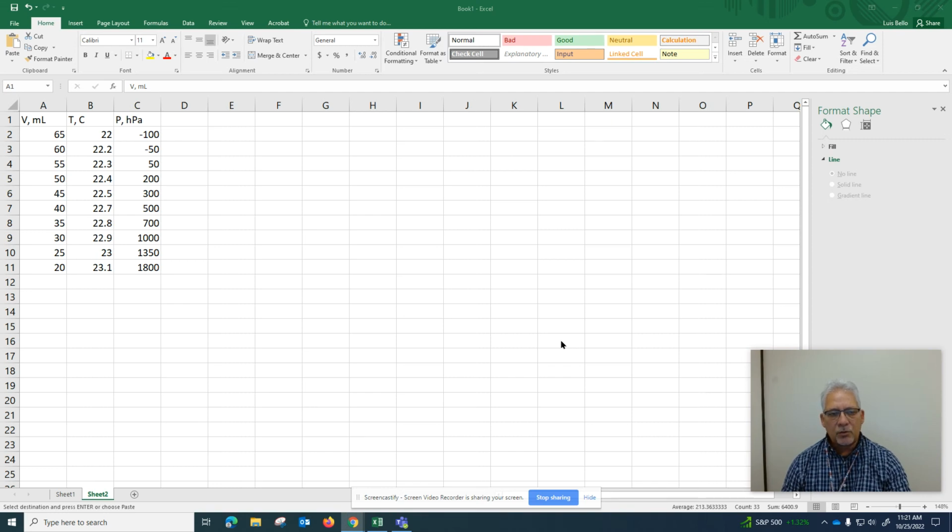Everyone, I just want to give you an overview of how to enter the data in Excel for the lab Excel and gas, the one that you are going to do today. I did my own experiment using this device that you probably know already. If not, you will be using it today in class.